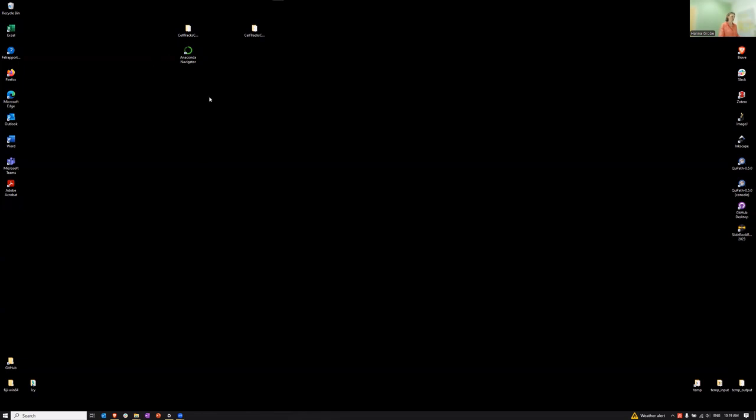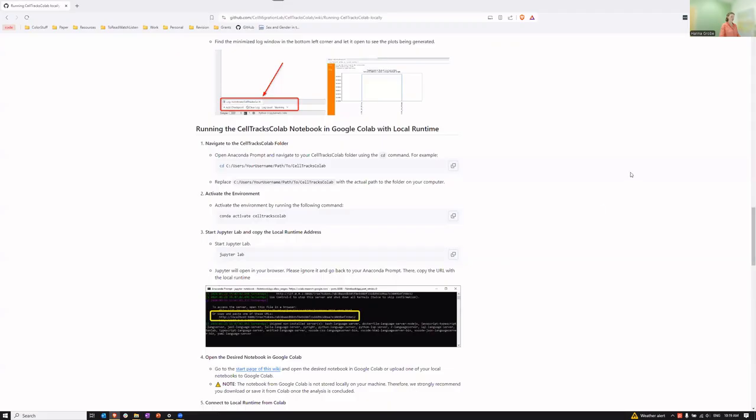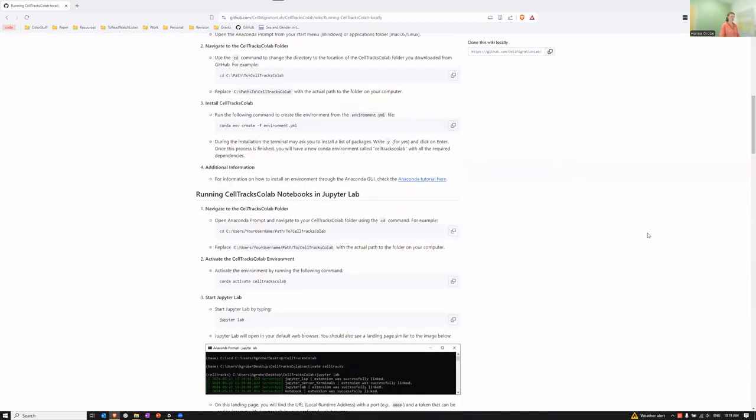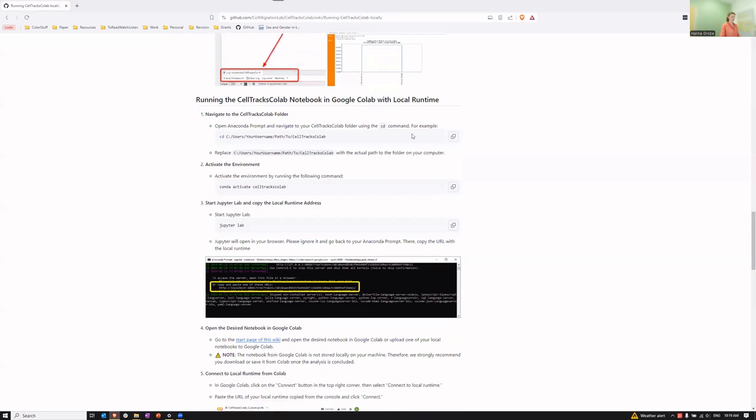You have Anaconda installed, and we're going to assume that you have already installed the CellTracksColab environment. If you have not, please watch the previous video on how to run the notebooks locally in Jupyter, where I've explained how to install the environment. You should also have the wiki open on the page running CellTracksColab locally. You will also find the instructions to run it with your local runtime.